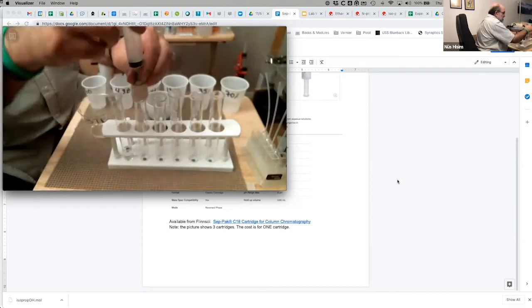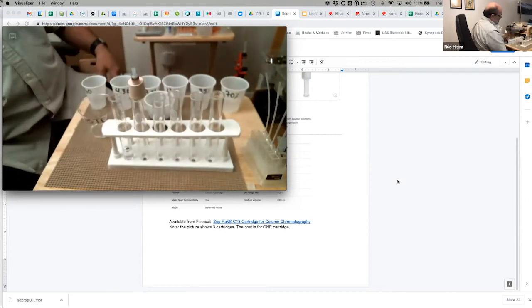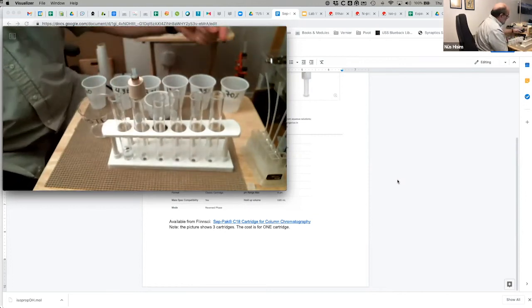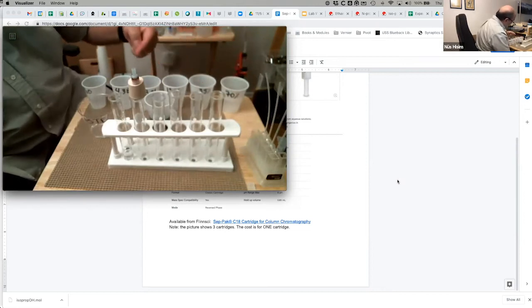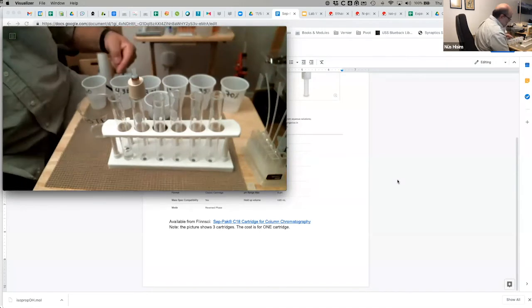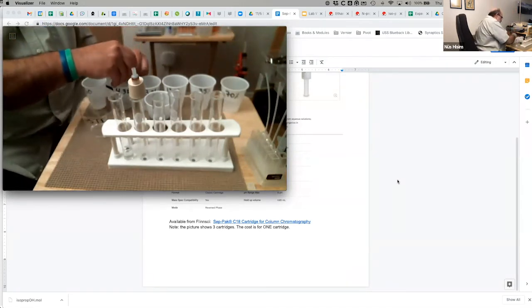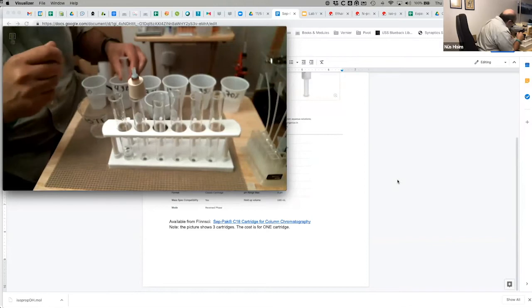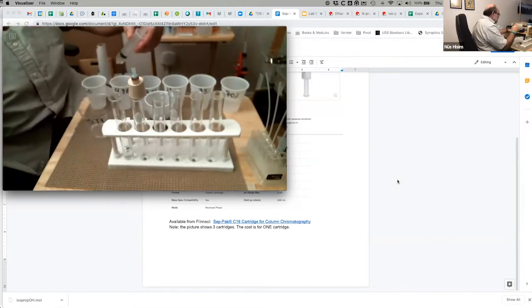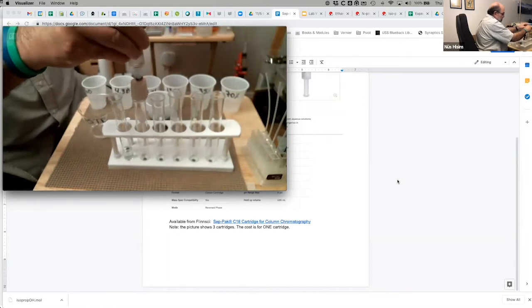And now this time, let's get some alcohol. In the procedure, what you do is you make a serial dilution of 70%. So 70%, 35, 17 and a half, 8 point something or other, and 4 point something or other. Then you start from the low concentration and work your way up, right? So this is 4.38% alcohol, the rest is water. And let's kind of walk that through the column.